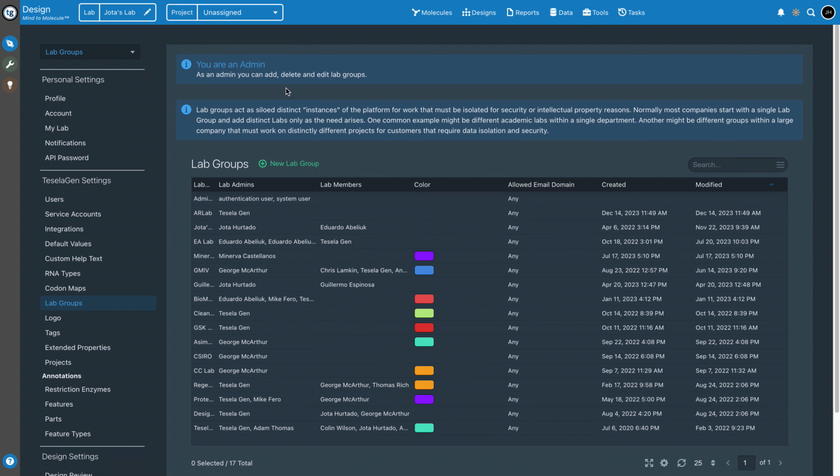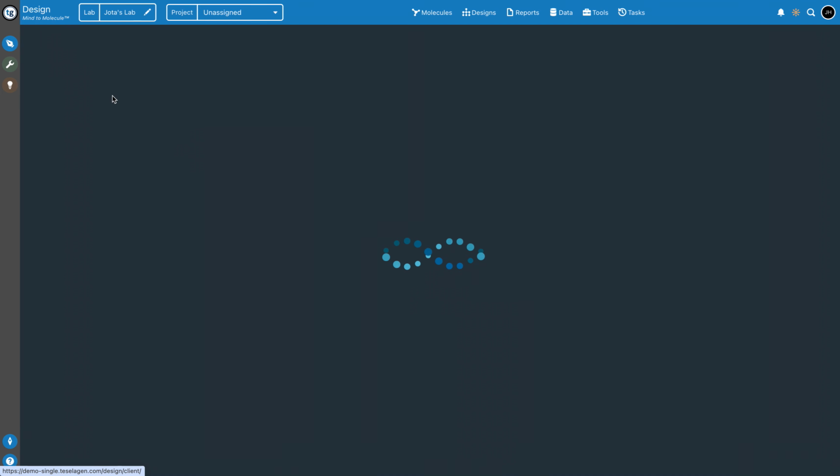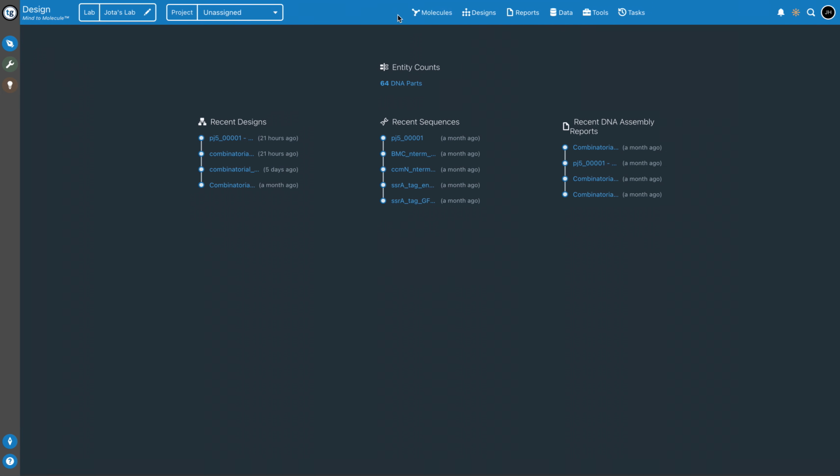I'm going to go now to the DNA molecules. The logic of the workflow here is that you will upload your molecules first.